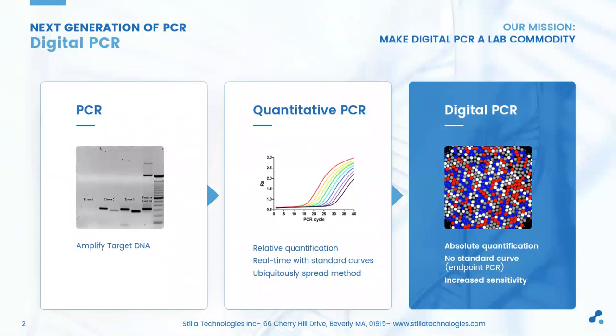Digital PCR is the third generation of the well-known polymerase chain reaction, or PCR, a widely adopted technique in the molecular biologist toolkit. PCR allows for the detection of targeted nucleic acid sequences by specifically amplifying them in solution. By following the evolution of an increasing fluorescent signal as PCR occurs, the so-called quantitative version of PCR, qPCR, allows for the quantification of the targeted sequences as well.